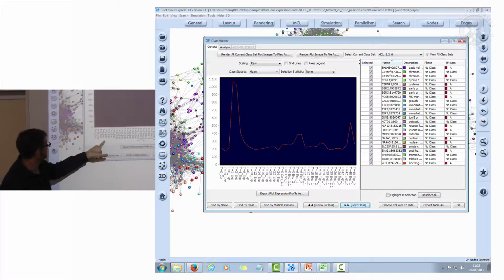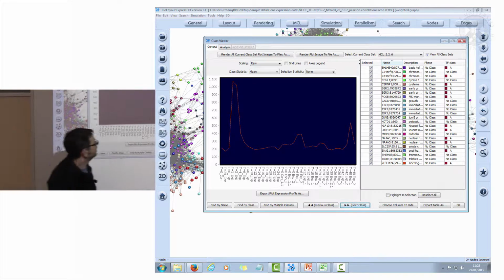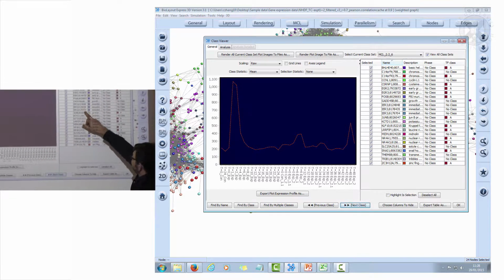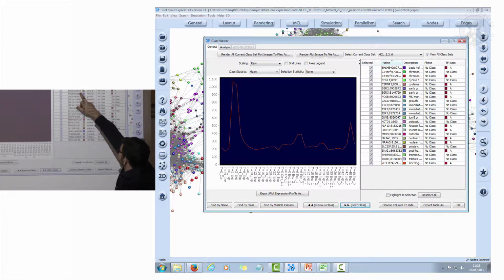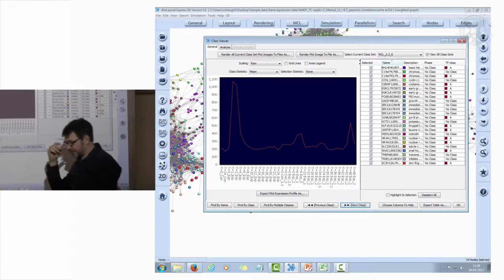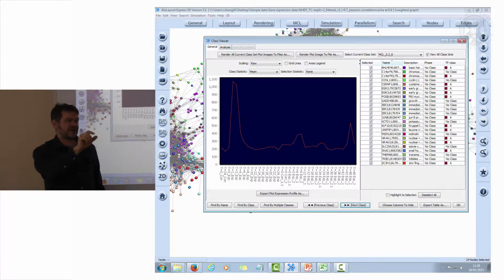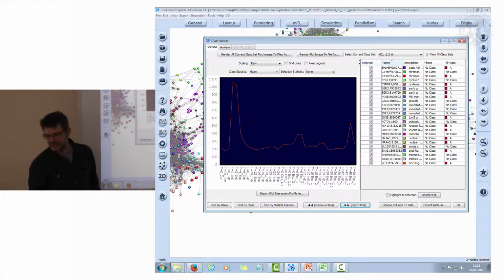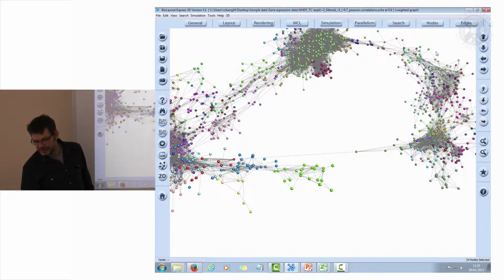They go up at 1 hour, with maximum expression at 1 hour, and if we look at what they are: immediate early response gene 3, JUN-B, FOS, early growth response 2, early growth response 3. A lot of these are the early response genes. In a lot of time courses, if you look at the LPS data, if you've captured those early time points, you will often see these guys changing. These are basically the first things that change when we stimulate the cells.